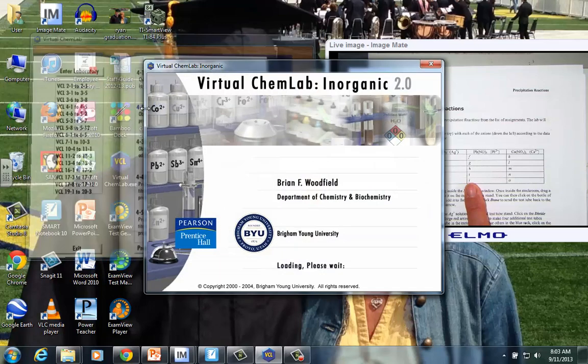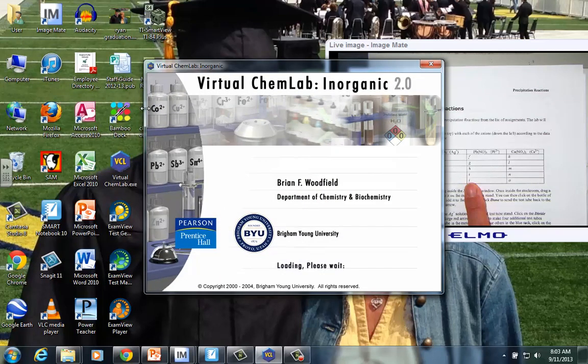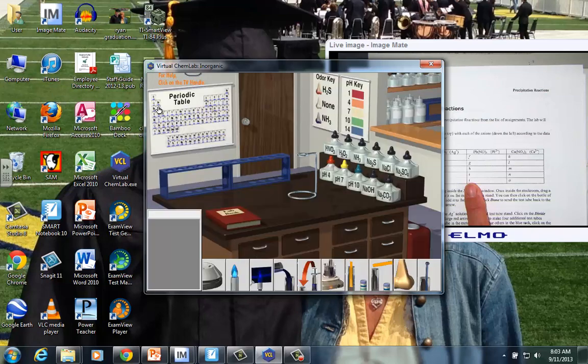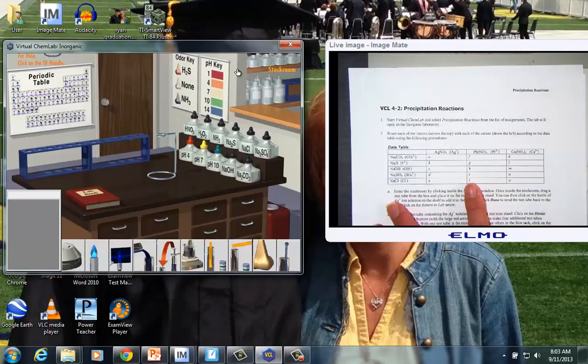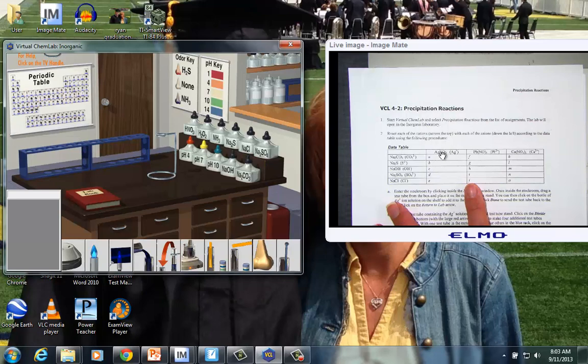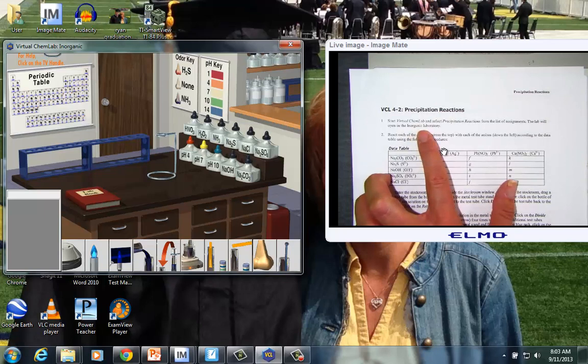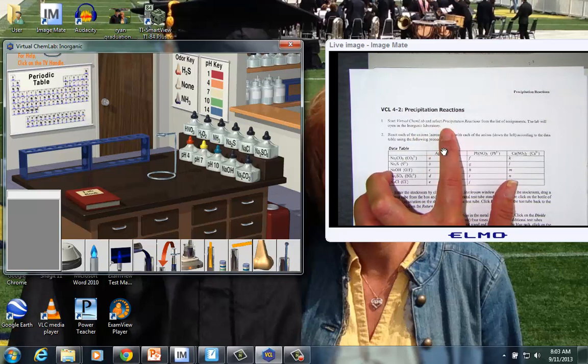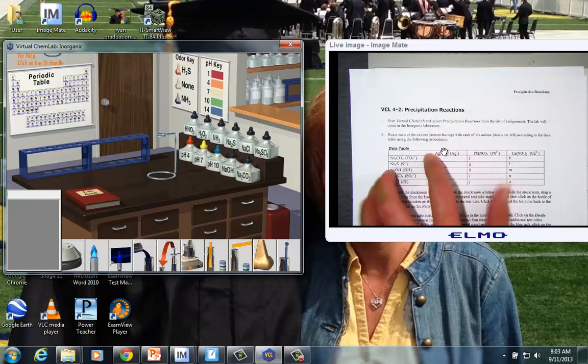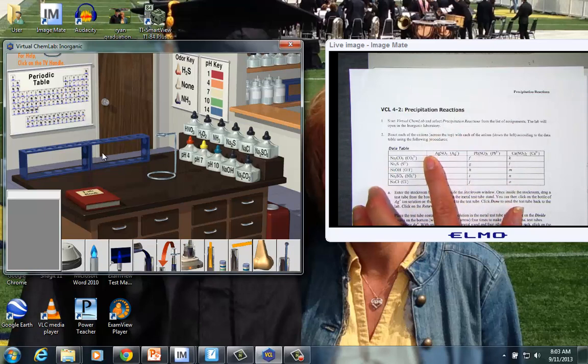Manipulating the Virtual Chem Lab by that lab book opens the program directly to the experiment that you'll be conducting, so it's very handy to do it that way. Over on this screen, we have the actual handout that we're filling out. So step one, Virtual Chem Lab, we selected Precipitation Reactions from our list of assignments. We opened the lab with the lab book, and what we see across here on the table is the list of solutions.